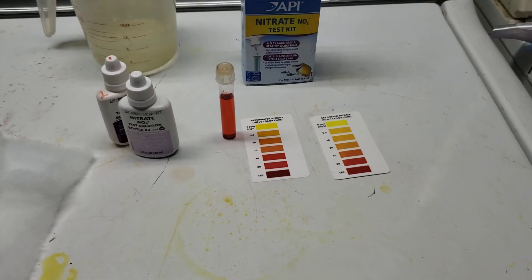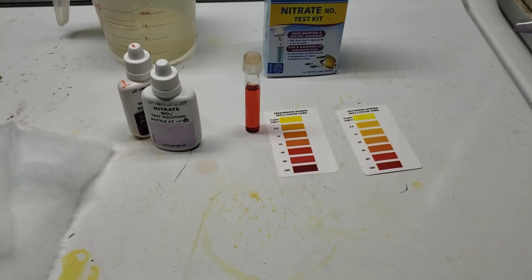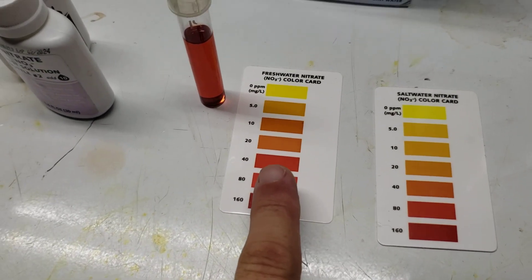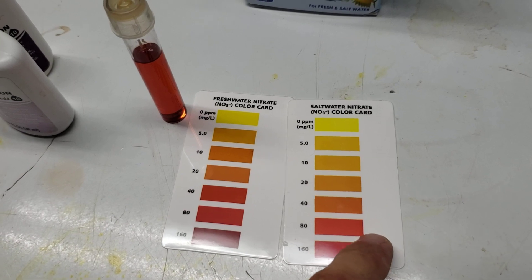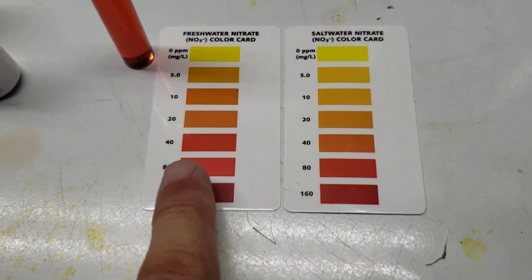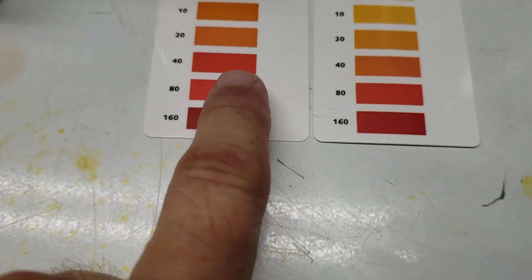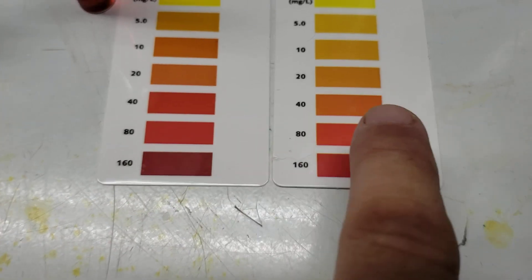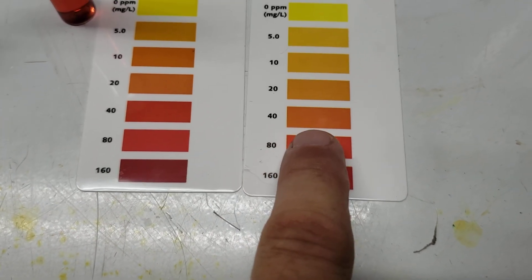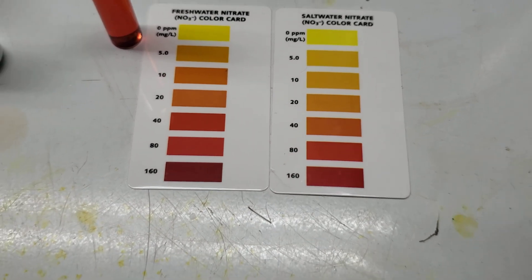I'm going to show you an example of how you can tell these are not meant to be super precise. If you look at the freshwater card versus the saltwater card, you will notice that the color codes are ever so slightly different. Look at the 40 parts per million — look how red it is on the freshwater, and then look how orange it is on the saltwater. So there's very clearly a color difference. It's subtle, but it's there.